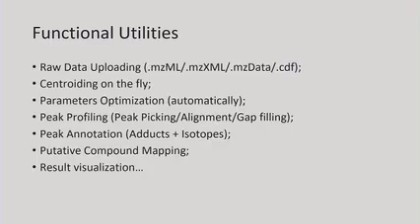We also support centroiding on the fly, but this is not encouraged because uploading profile data is really slow. It's going to be gigabyte level. We don't support that kind of large data uploading. We support a maximum of 200 megabytes. So it's better to do the data centroiding locally to convert the data into centroid mode.